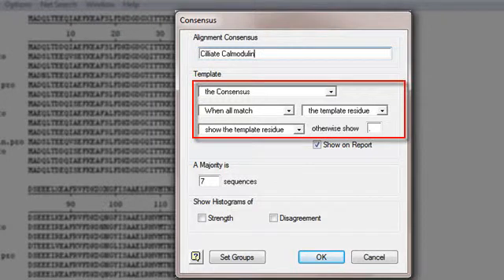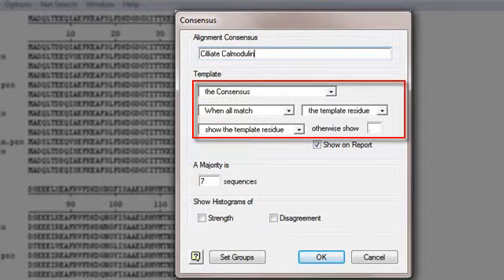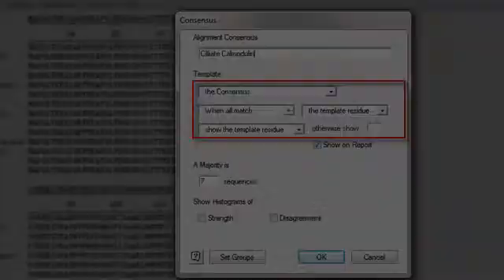I need to build a sentence that describes the function of the consensus by choosing a phrase from each of the four pull-down menus. I'll use these menus to ask Megalign to compare each sequence to ciliate calmodulin.